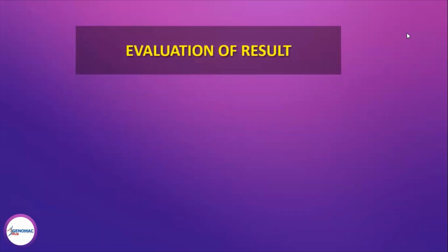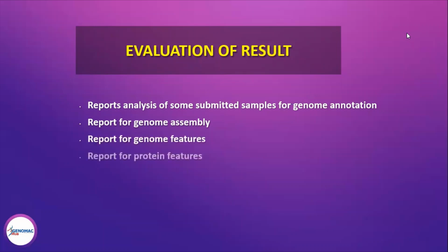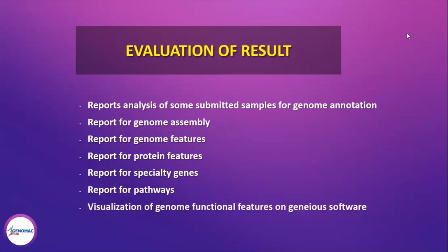In evaluating the results, we'll be looking at reports analysis of some submitted samples for genome annotation, which included the one we used. And reports for genome assembly, report for genome features, report for protein features, report for specialty genes, report for pathways, and then we're looking at visualization of genome functional features on Geneious software.